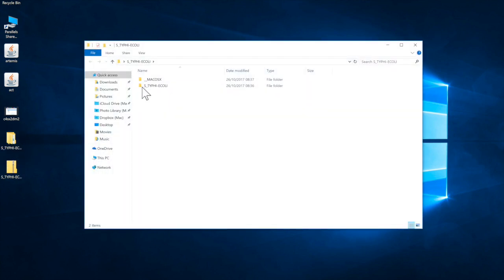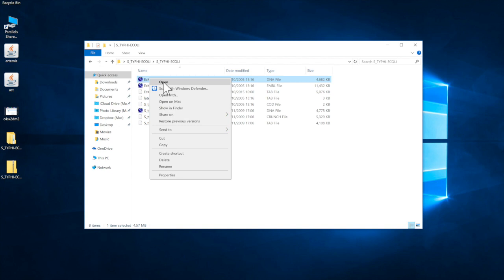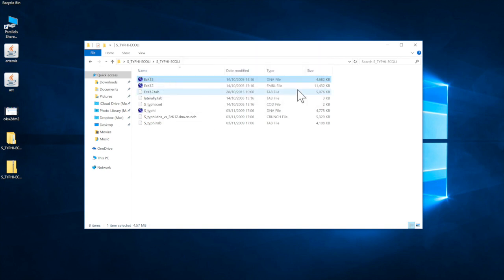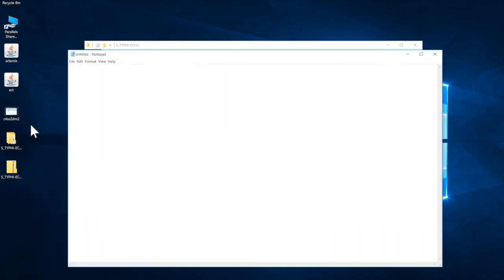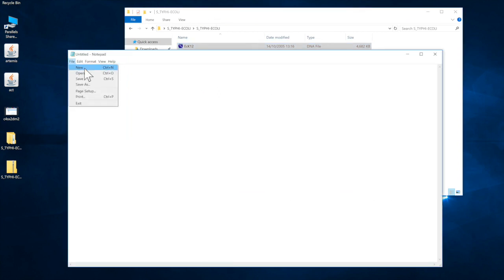It's worth having a quick look at some of that data and thinking about some of the formats that were involved, because the formats that you're seeing are one of two formats. There's either a FASTA file, which can be looked at in something like Notepad, and we can get Notepad up here, and if we open this, we'll see that it's just a text file.